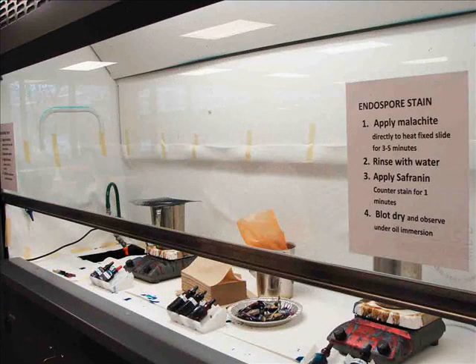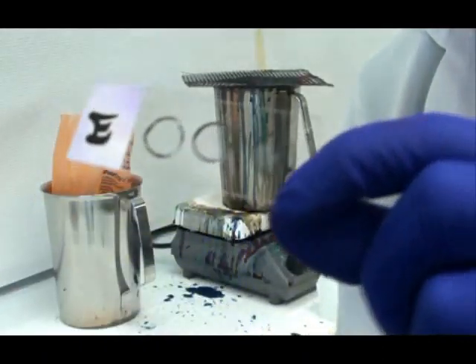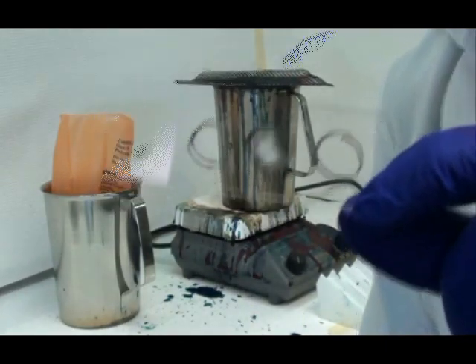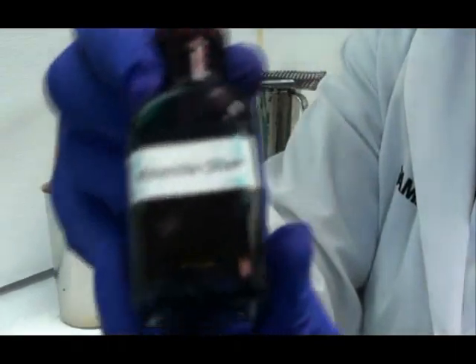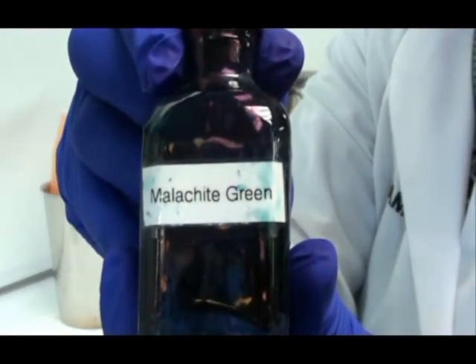We begin by applying the primary stain in a fume hood. Here's my prepared endospore slide. My unknown is in the center circle and my two controls are in the outer circles. I place my slide over the water bath and now I'm ready to apply the primary stain, malachite green.